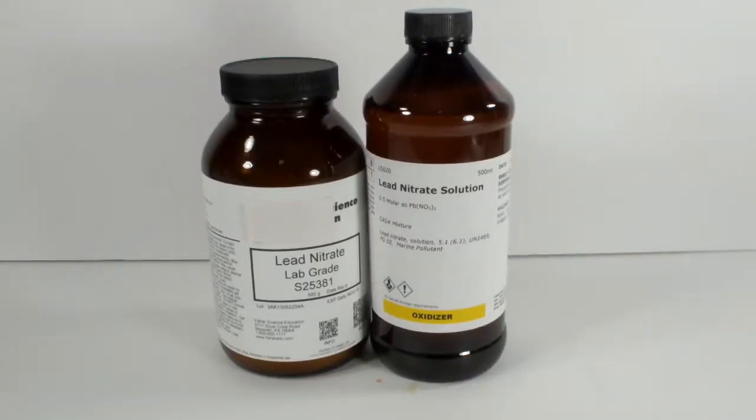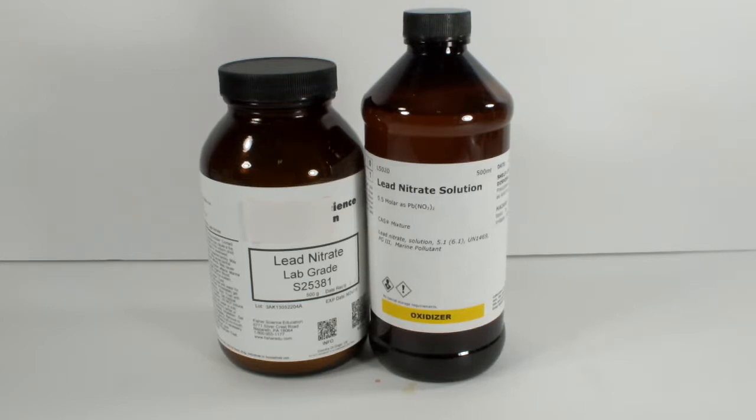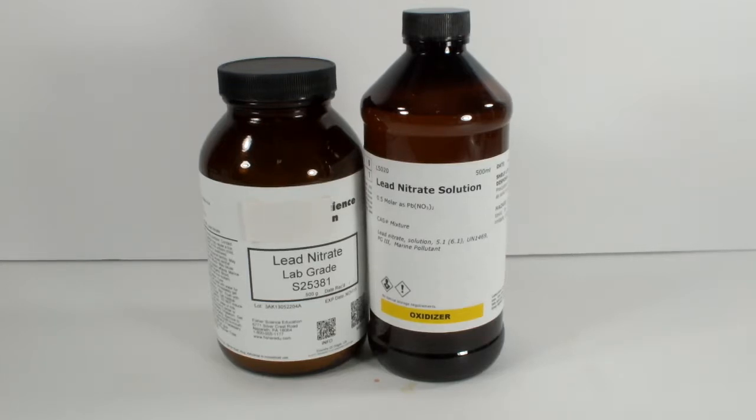In a break from tradition, when I purchased this material, I actually used it right away. Using this 0.5 molar solution, I built a galvanic cell. Unfortunately, I was unable to find the photos I took of the process, but as soon as I publish this, I'm sure they'll turn up.